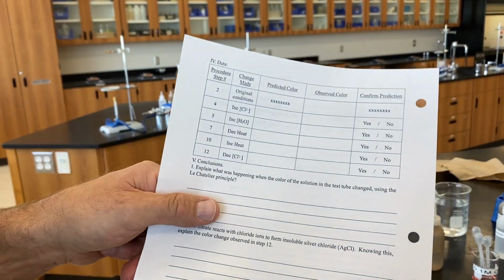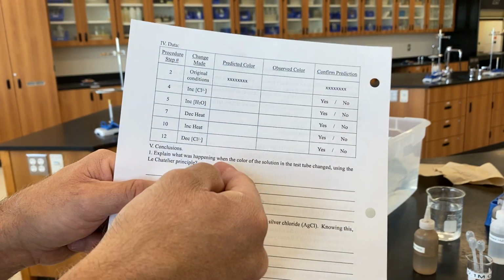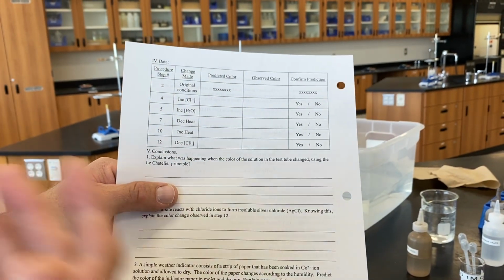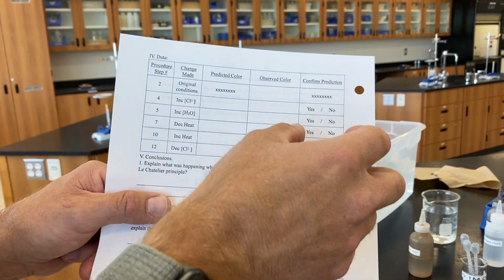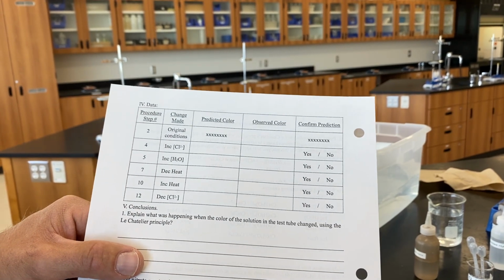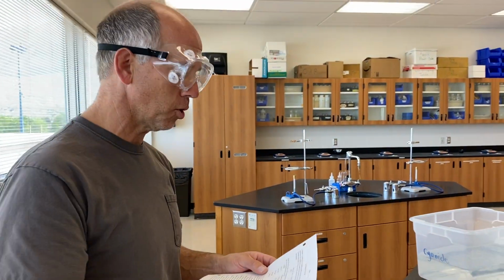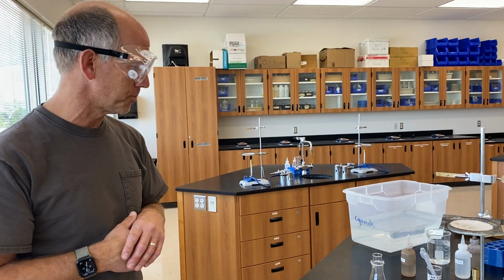then you will transfer these predictions to the data chart on the back of the lab, recording your predicted colors here. Then we'll make these observations while we're actually carrying out these equilibrium shifts, and then we'll determine whether or not our predictions were confirmed based upon our experiences. So if you haven't yet done that work, stop this video, go back and watch the introductory video, and then pick up here when you're ready to go.